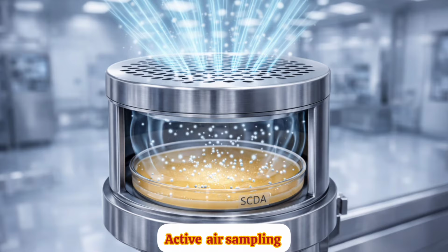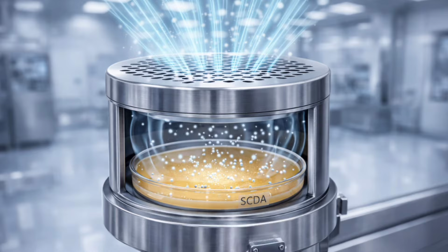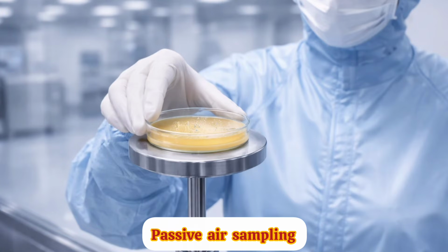In active air sampling, the surrounding air is sucked by a mechanical pump through the device. But in passive air sampling, the plate is exposed or kept in a fixed location for up to 4 hours to assess the microbial fallout from the surrounding air.